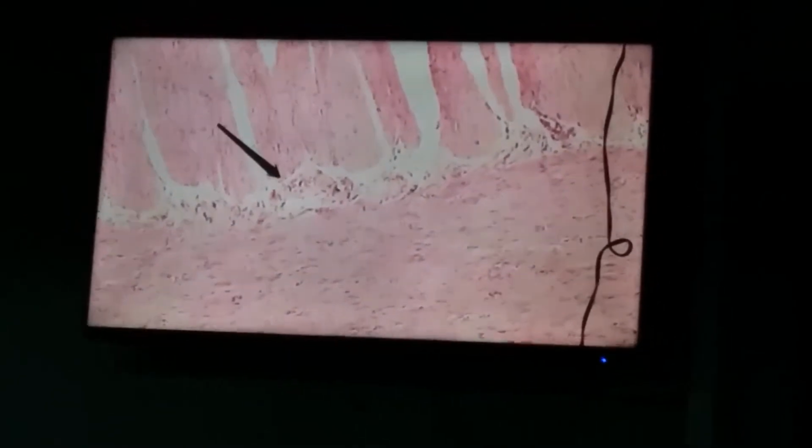That is the arrangement of muscle in the ileum: inner circular here and outer longitudinal. ICON, I-C-O-N: inner circular, outer longitudinal. Now, this is actually a nice to know. Look at the center of this type of muscle. That's ICON, so inner circular, outer longitudinal.